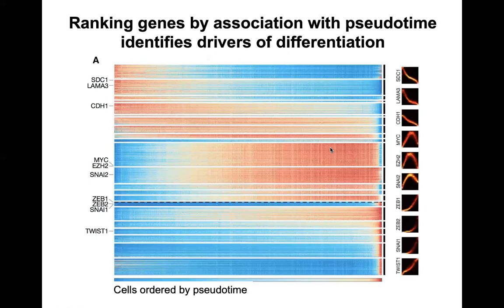Another thing that you can do is try to figure out if relationships are dynamically changing over pseudotime. So you have these cells ordered by pseudotime, using potentially one of the pseudotime methods that Dan talked about. And then you can compute mutual information with respect to pseudotime. So here also you see that there's a lot of nonlinearity.